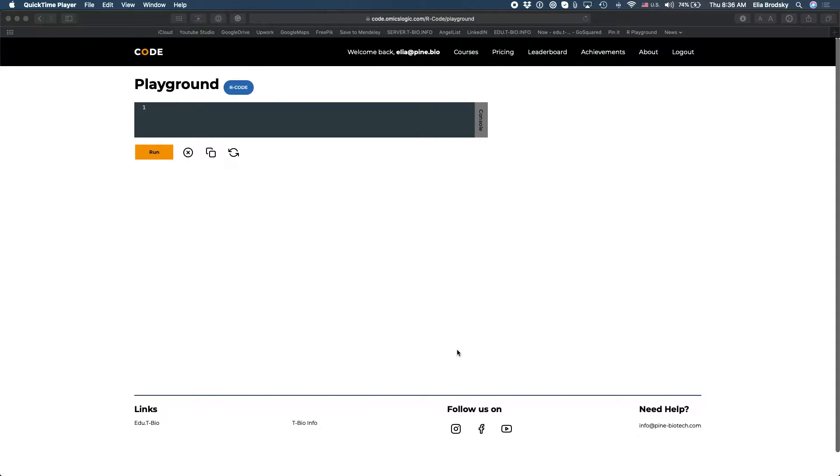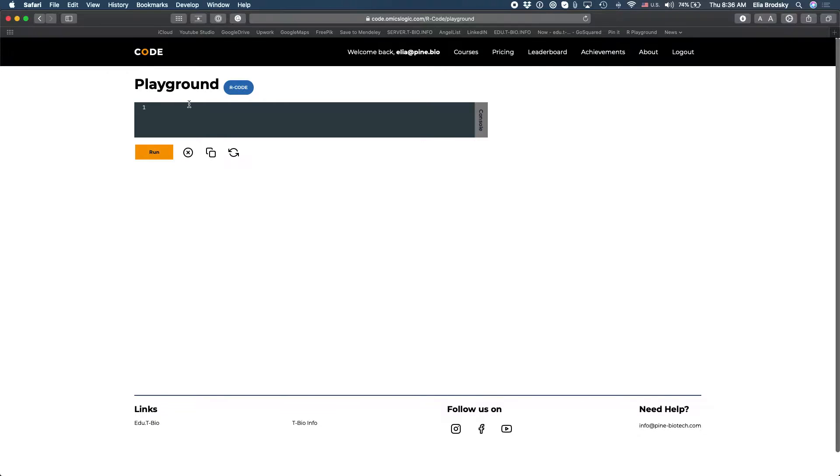In this short tutorial I'm going to show you how to run principal component analysis in just a few lines of code in R. So the first thing that we want to do is call a library.